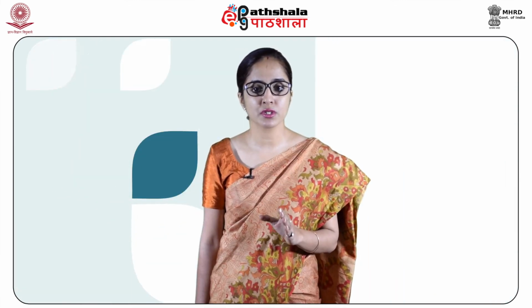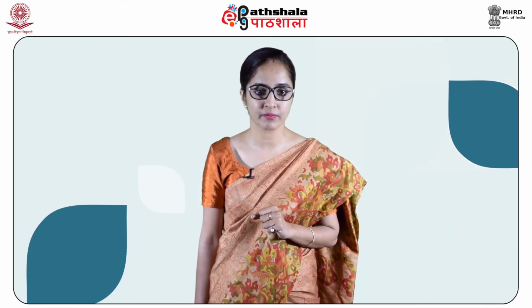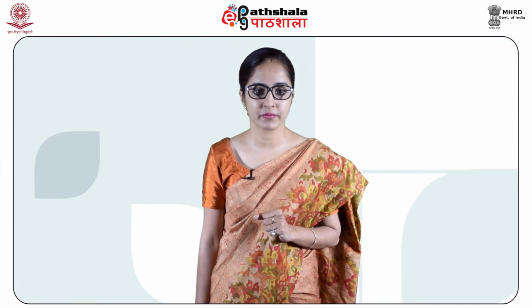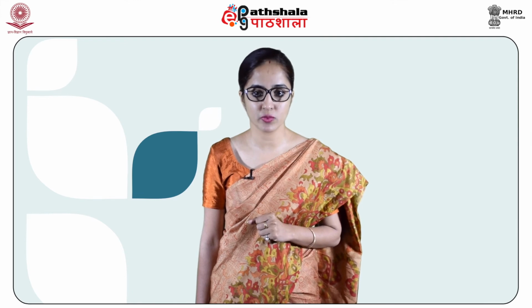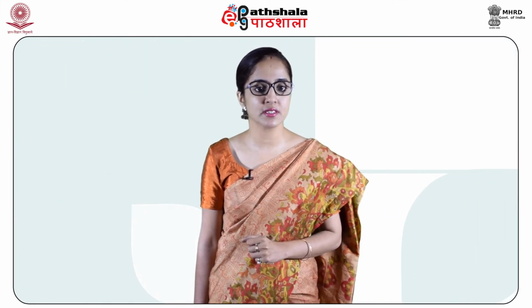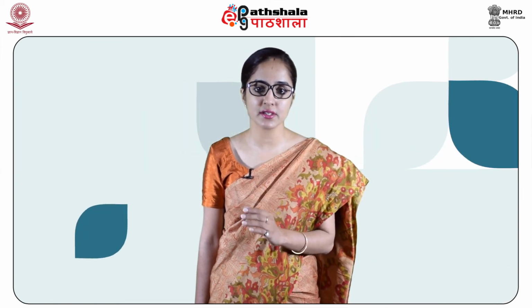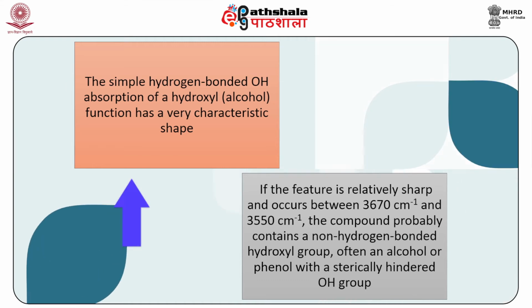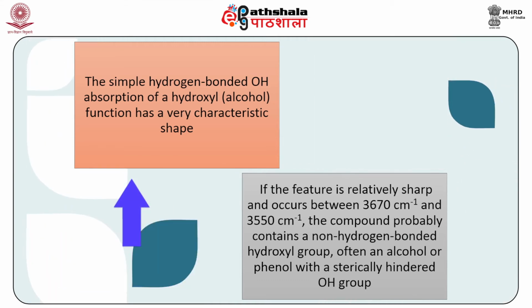The NH absorption usually has one or two sharp absorption bands of lower intensity, whereas an OH usually gives a broad absorption band. If there are some additional moderate to intense bands present in the ranges 1600 to 1300 cm⁻¹, 1200 to 1000 cm⁻¹ and 800 to 600 cm⁻¹, the compound is more likely to be a simple hydroxyl compound. The simple hydrogen bonded OH absorption of a hydroxyl alcohol function has a very characteristic shape.